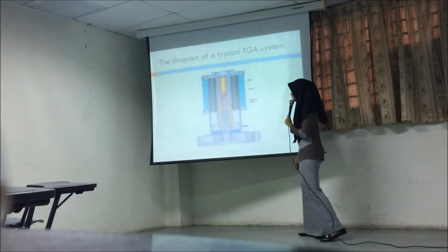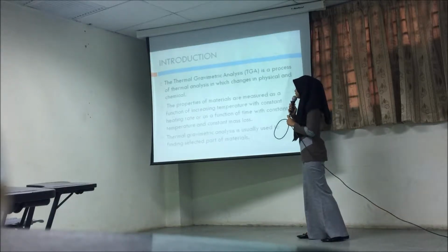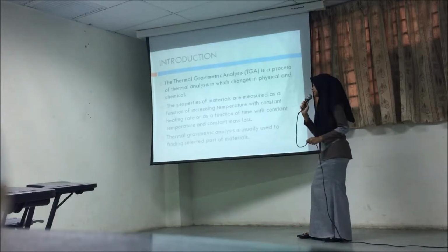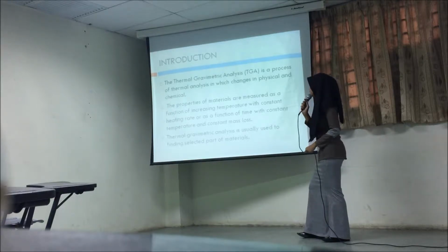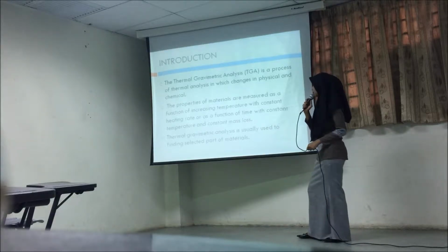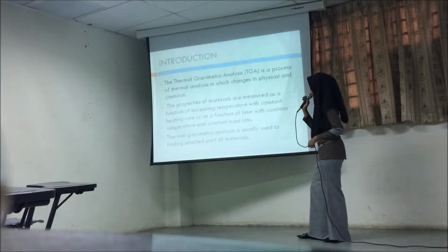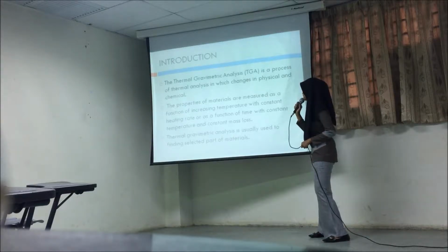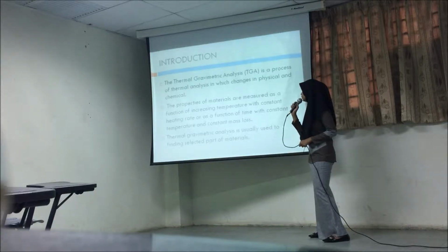Next slide, I want to present my part, the introduction. Thermal-Gravimetric Analysis (TGA) is a process of thermal analysis in which changes in the physical and chemical properties of a material are measured as a function of increasing temperature with a constant heating rate, or as a function of time with constant temperature and a constant mass loss.